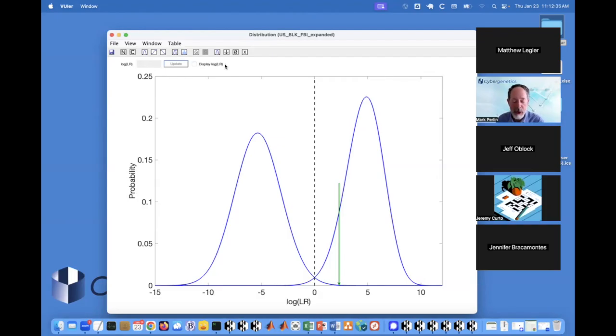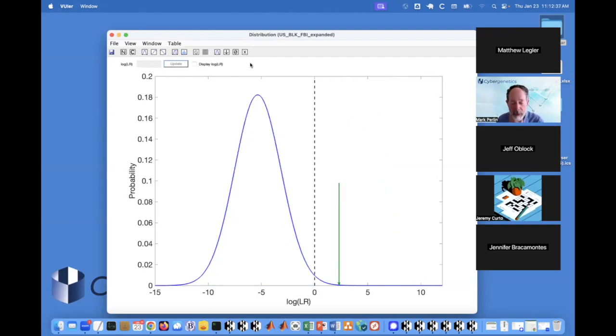So actually, Matt, turn off the contributor distribution. That's the non-contributor distribution. This is the equivalent of if you had compared the evidence genotype that was separated out for this contributor with all trillion possible genotypes, except that there's some math that does this for you with Bayes' theorem that's described in that Helion paper that constructs it exactly so we can work with it. You can see it, we can calculate with it, and you'll be able to report from it.